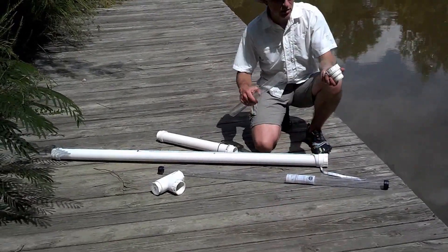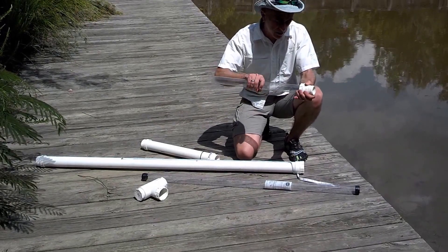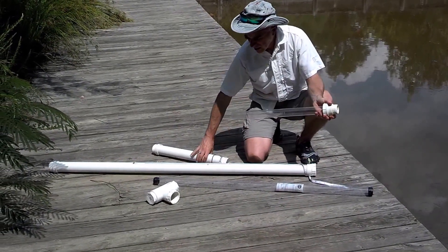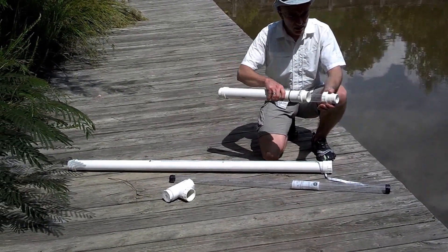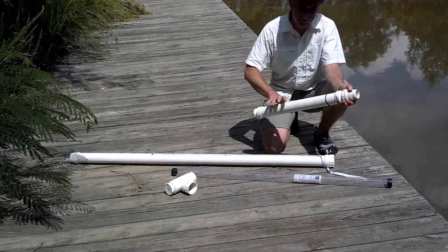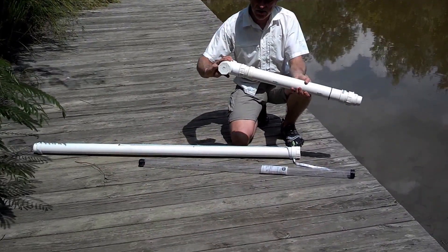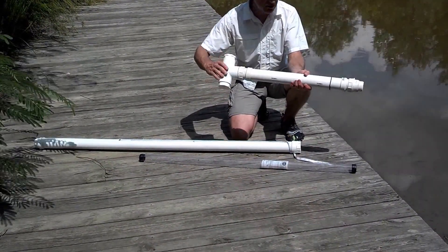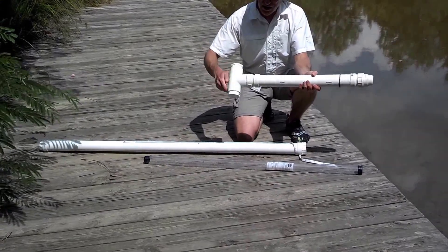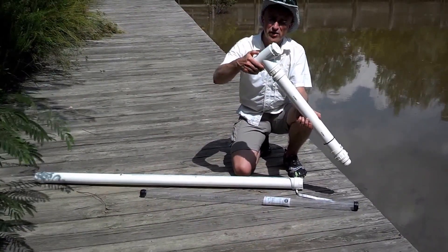First I'll insert one end of the core liner into my cutting bit, then I'll screw the cutting bit onto the end of the core barrel. Next, I can take the handle and screw that onto the end of the core barrel and I'll be ready to insert this into some sediment and retrieve a sediment core.